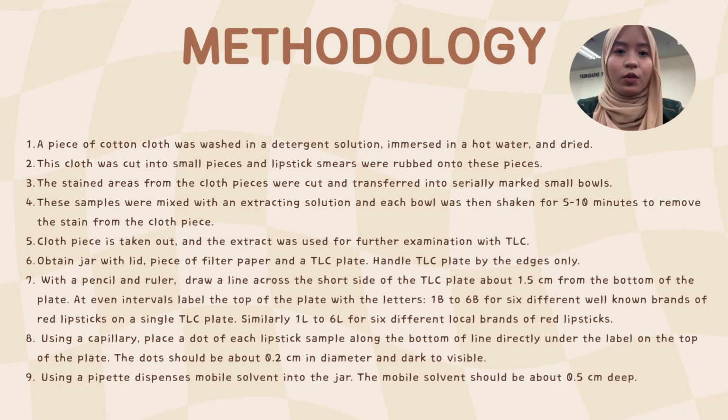Number 6. Obtain a jar with lid, a piece of filter paper and a TLC plate. Handle the TLC plate by the edge only. Number 7. With a pencil and ruler, draw a line across the short side of the TLC plate about 1.5 cm from the bottom of the plate.